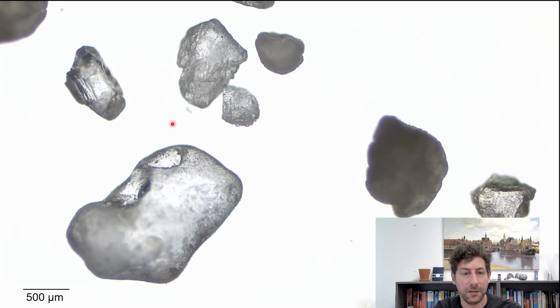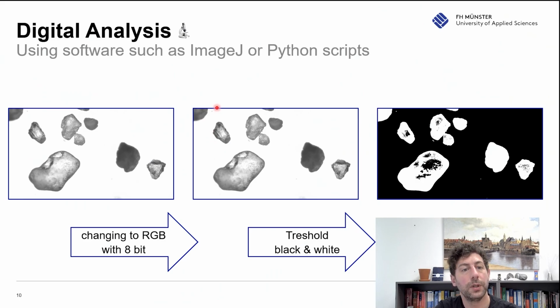So this is sand, very simple particles. And now you put them in the microscope, and the question is, okay, how do we measure the size now, right? Because they have these weird shapes, and here we have the scale. And now we can make use of Feret diameter and so on to measure it reproducibly, right? And what we do is we make these images in the microscope, and then we have to process them, and you can do this with tools like ImageJ or Python.